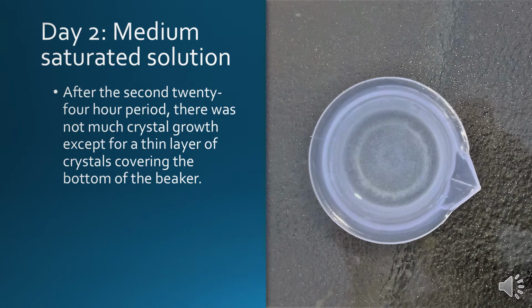Day 2, medium saturated solution. After the second 24-hour period, there was not much crystal growth except for a thin layer of crystals covering the bottom of the beaker.